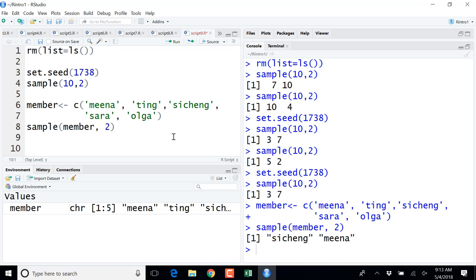However, we cannot make an MS run order like condition 1, 1, 1, condition 2, 2, 2, condition 3, 3, 3, condition 4, 4, 4. This is not good. We actually need to completely randomize this order, right? How can we do this? We can use the sample function.